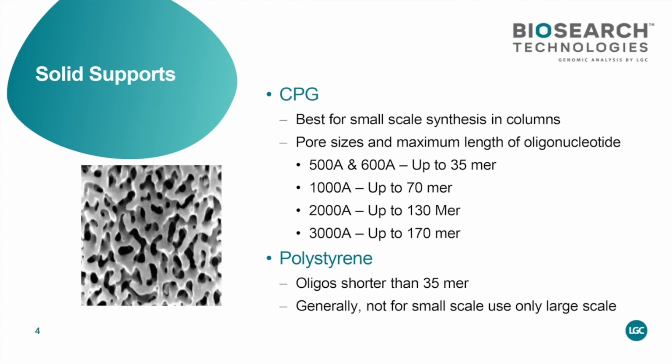There is a different solid support. It's called polystyrene. That is a bead that's coated with a linker. So imagine a little ball or a little hedgehog that kind of curled in on itself.